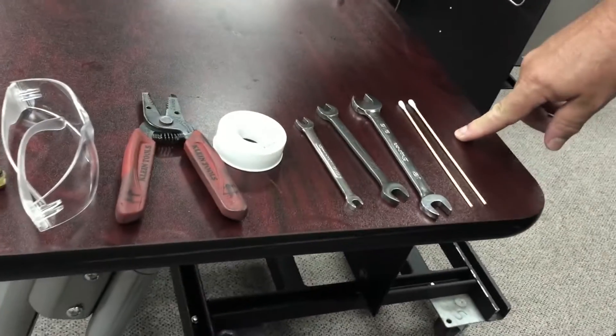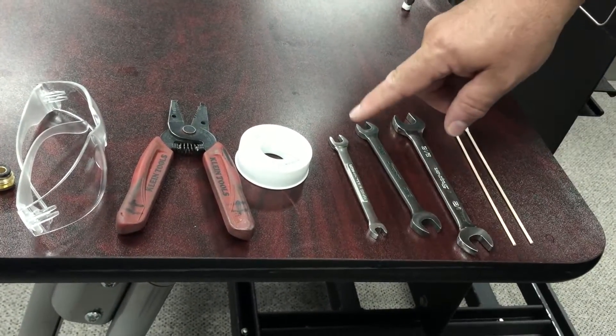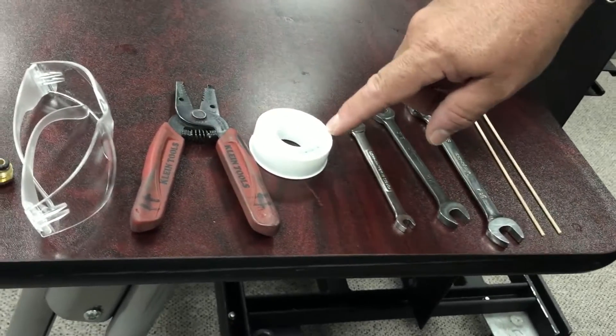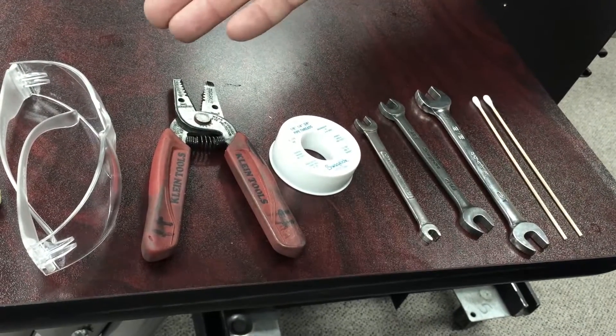You'll need several Q-tips, a 9-16 inch wrench, 7-16 inch wrench, a 5-16 inch wrench, a quarter inch wrench, some Teflon tape, a cutting device to remove the end of the lubricant, and some safety glasses.